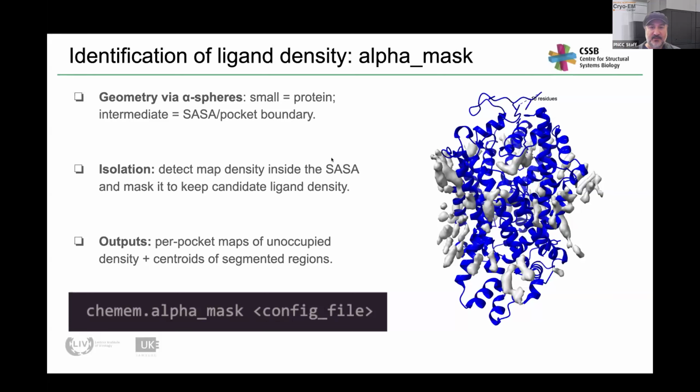A couple of questions about searches for ligand sites. One, is it possible to dock a ligand that may have density for multiple conformations of that ligand? Yeah. Well, I have experienced this before with a small molecule that had multiple conformations, and there was clearly one preferred conformation and then one that was the minor conformation, which had a benzene ring that had moved. And when you dock, the output you'll get essentially, it will pick how many iterations it needs to go.